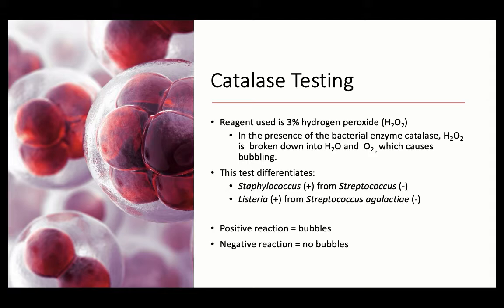To differentiate between staph and strep, though, make sure you do a gram stain before you do the catalase and assume that it's staph or strep, because it might not be gram-positive cocci. Corynebacterium, which is a gram-positive rod, is also catalase positive and looks a great deal like Staph aureus. So if you have a Corynebacterium, you didn't do the gram stain, and you think it's a staph, and it's actually a gram-positive rod, you're starting incorrectly from the very beginning. So always make sure you gram stain first. Make sure it's a gram-positive cocci, and then go ahead and do the catalase.